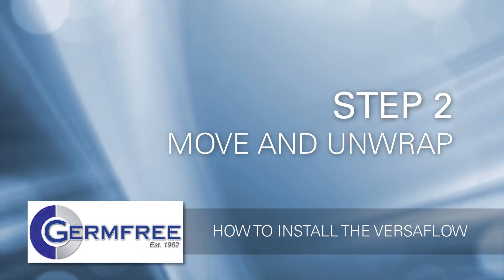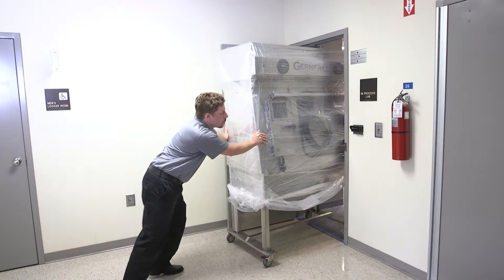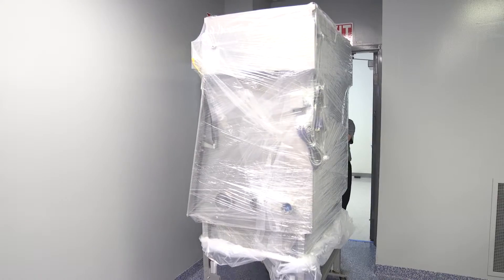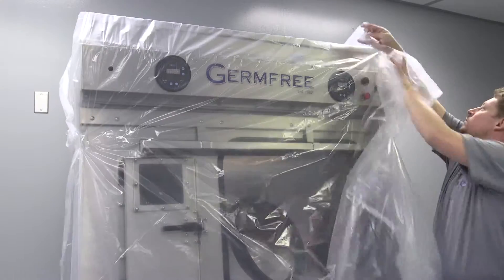Step 2: Move and unwrap the Versaflow. The Versaflow is a complete and self-contained unit and is shipped fully assembled. Wheels make it easy to move the Versaflow. The Versaflow is designed to fit through standard-sized doors, allowing for easy installation.